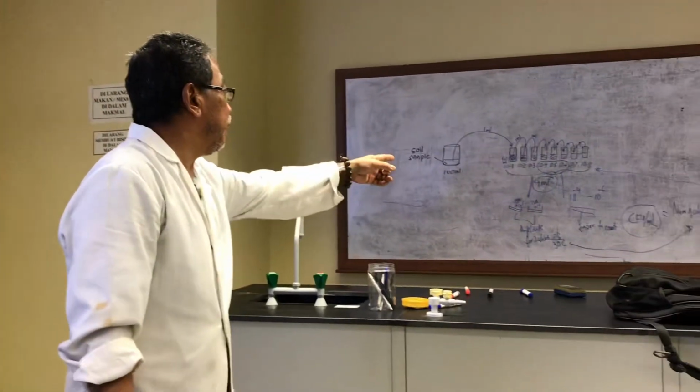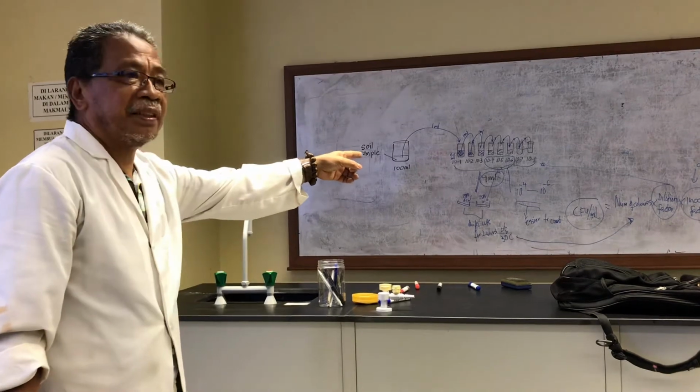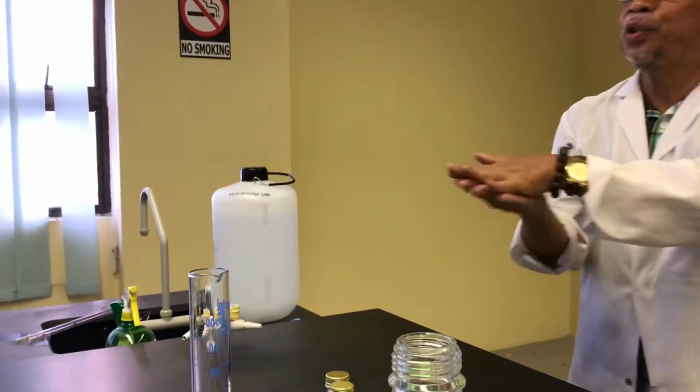So that is the technique. And then at the end of the day, you have to do the dilution technique. And then we have plates, we have cultures.